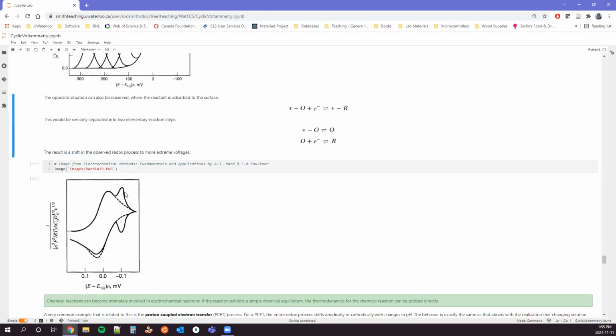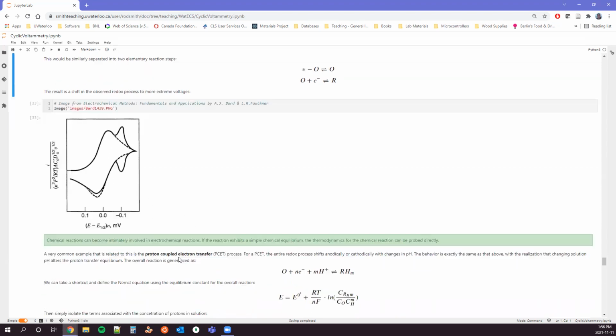And then because this is our precursor that's adsorbed to the surface, right? It's happy being bound to the surface. And so it takes basically extra energy to convince it to leave the surface. Again, this is Le Chatelier's principle embodied in the work.